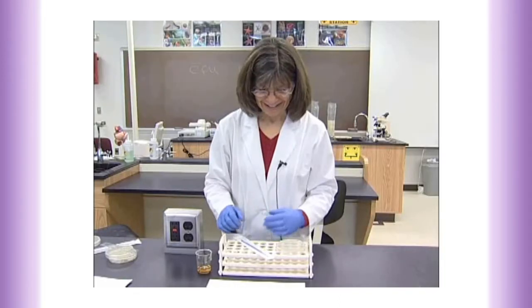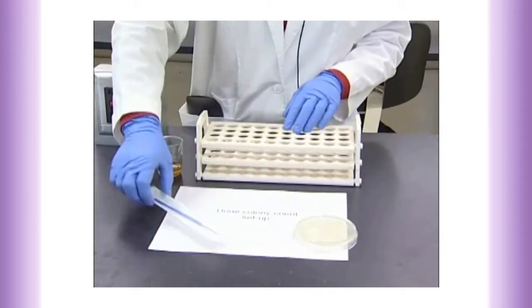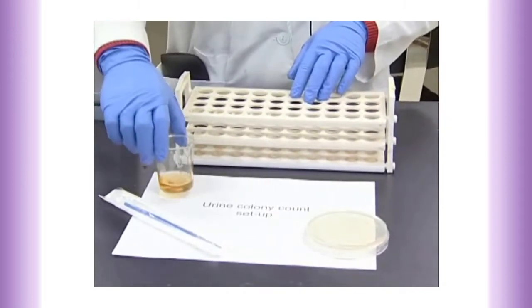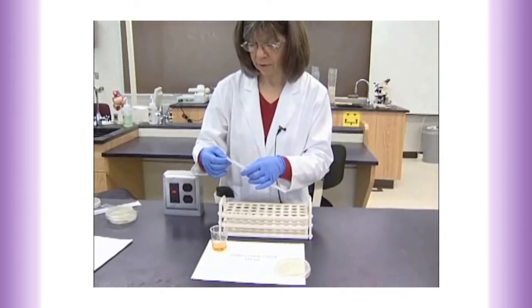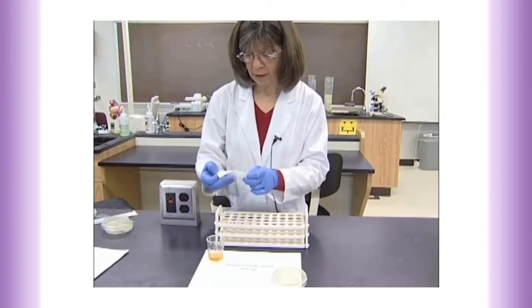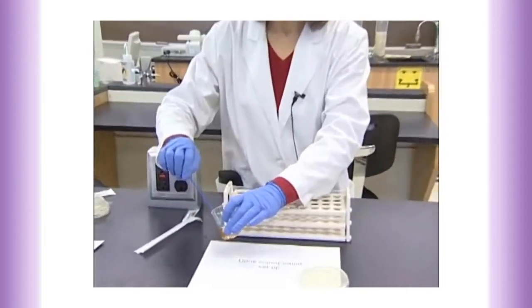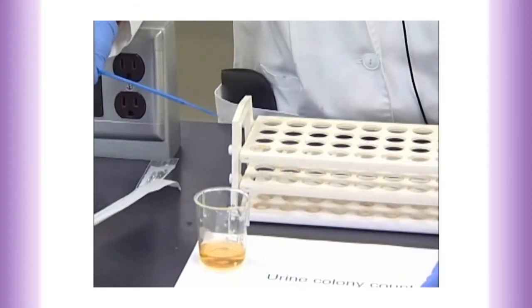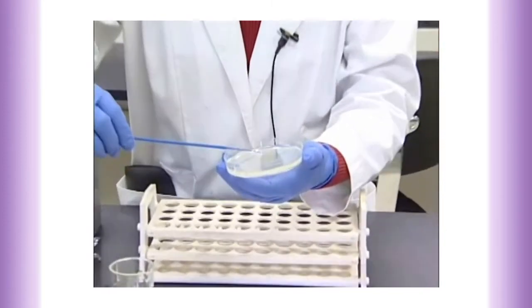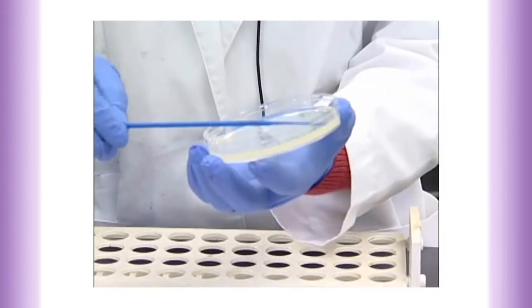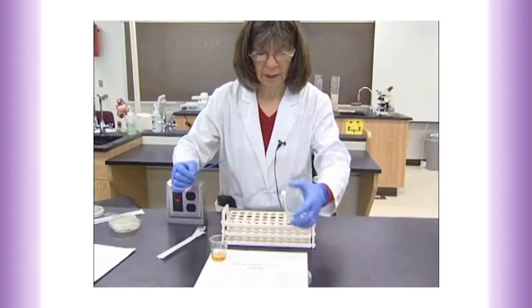The colony count setup requires the agar plate to grow the organisms on, a one microliter loop, and the urine specimen. Take the one microliter calibrated loop — this is sterile — open carefully, and pick up one loopful, which is calibrated to be one microliter of specimen. It is streaked straight down the center of the plate and then back and forth to spread out the colonies so that you can get a colony count reading after it has incubated.